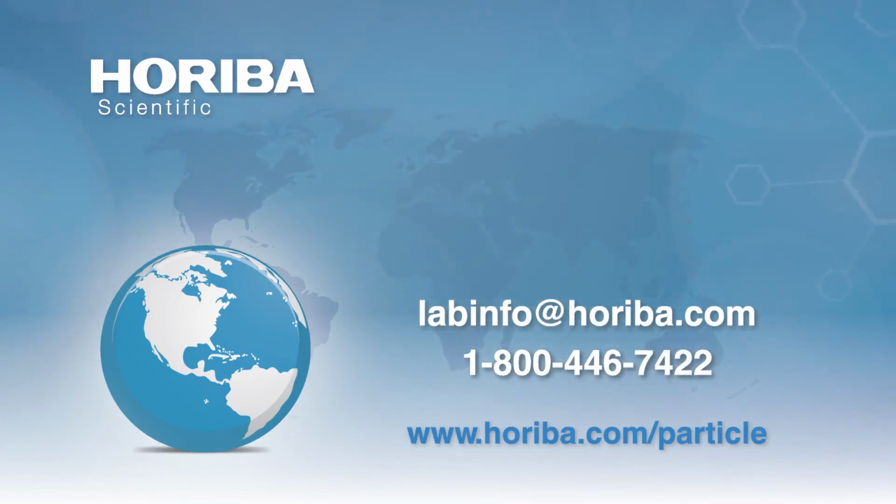But yes, if you simply take titanium dioxide, a rutile, and just make a suspension at pH 3, basically, but what you have to do, and I haven't got time to go into all this, one of the things I did talk about with respect to the silica is that the development of the charge on the surface is a kinetic process. It takes some time. It's not always instantaneous.